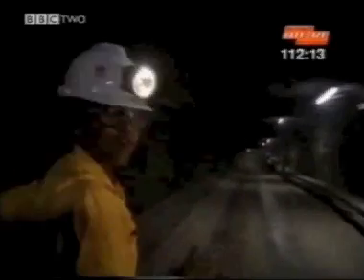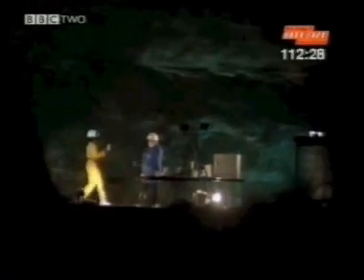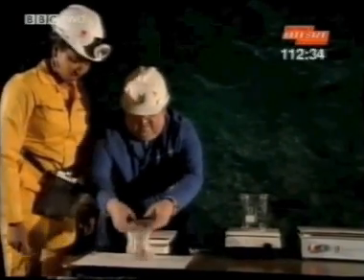It's the only rock salt mine in the UK, and it's enormous! Hi George. Yeah, I've collected my rock salt sample for analysis, so what do I need to do? Well done, Trish. I put the rock salt nicely on the weighing paper. Lovely jubbly.